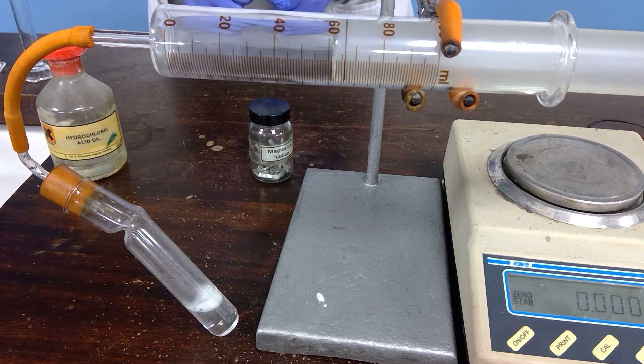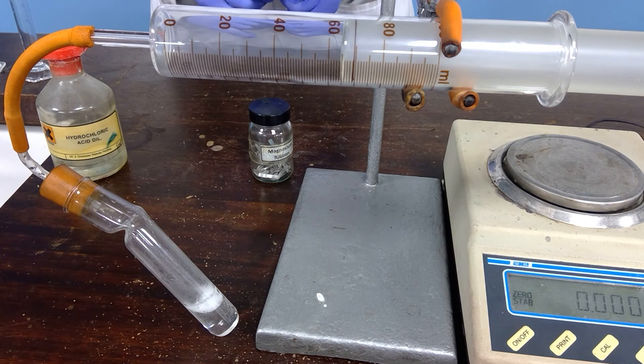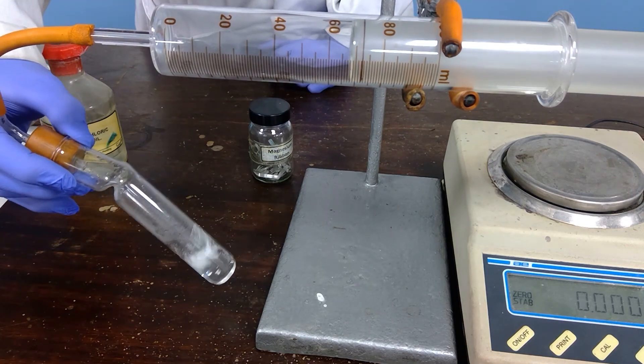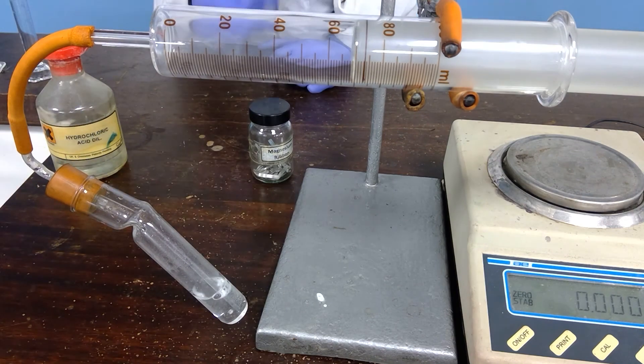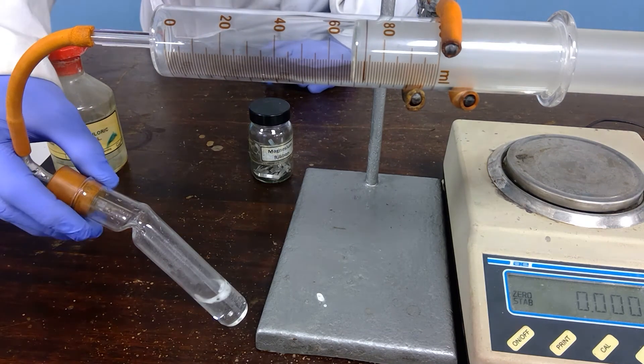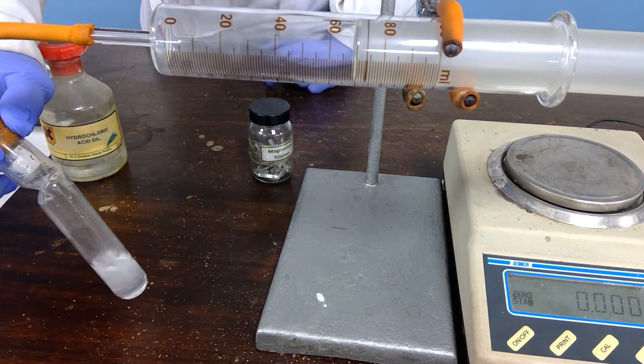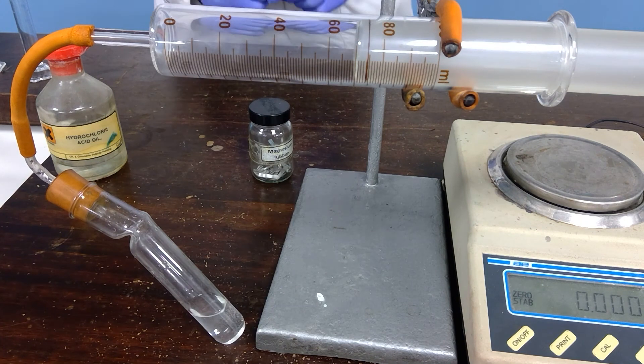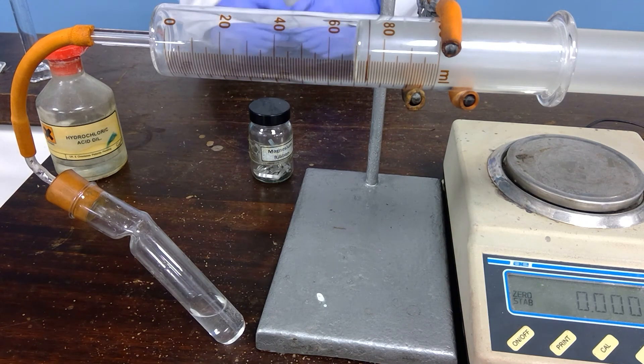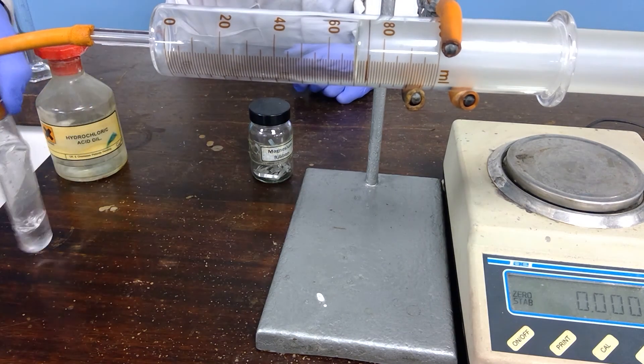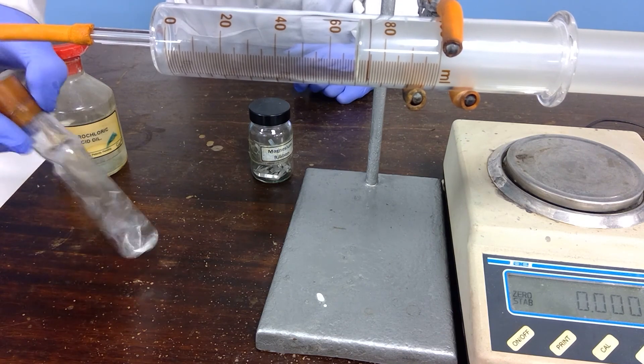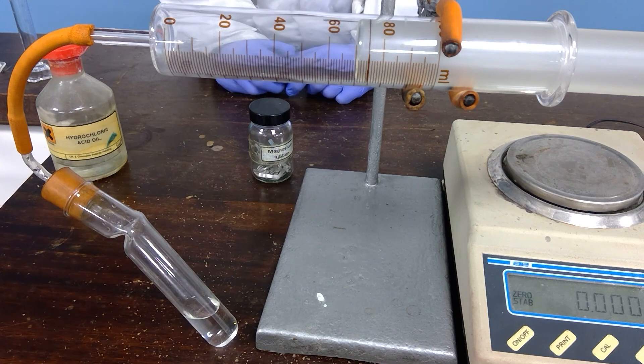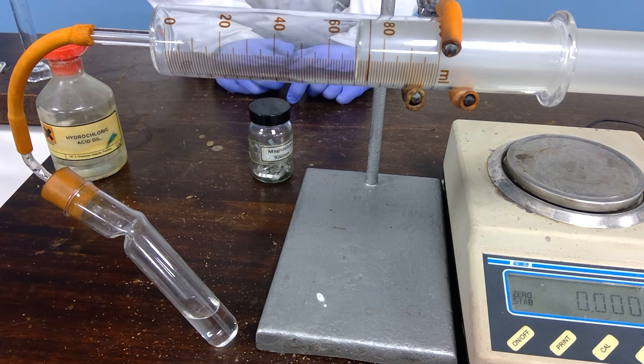And again you need to have a record of both the mass of the magnesium used and the volume. Reaction still occurring as you can see. Just making absolutely certain it's all reacted. And if you'd like to take that reading, we've got three readings for this particular experiment.